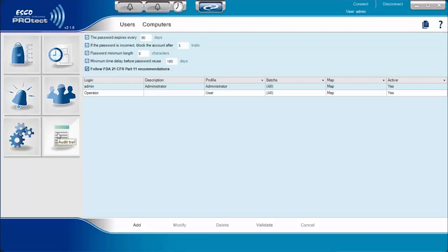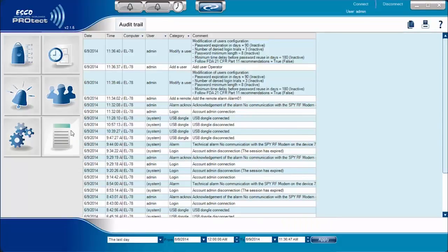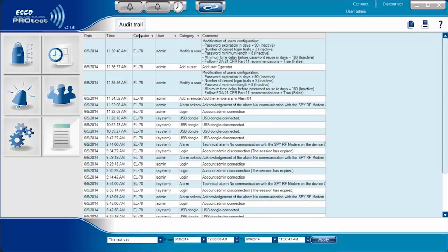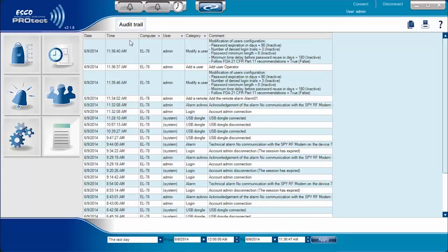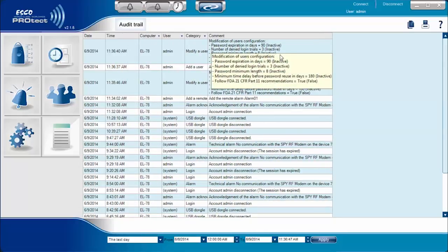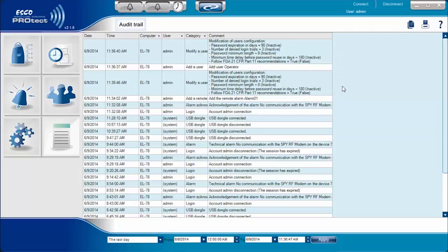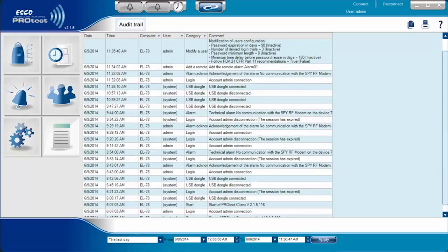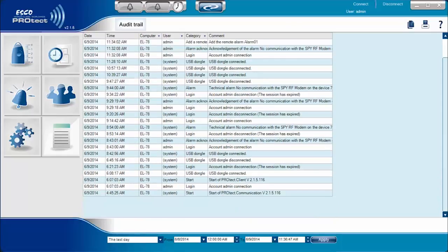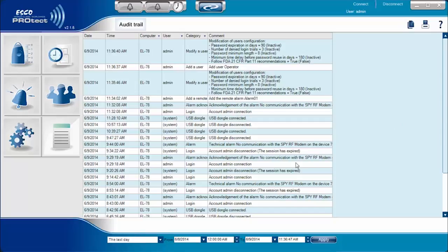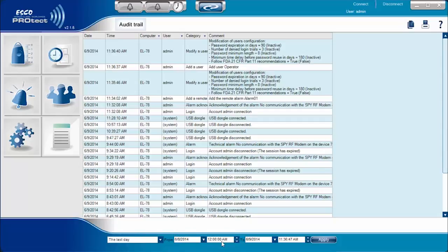The Audit Trail of ProTech is the informer of ProTech. It records all actions performed in ProTech, such as modification of configuration, log in, log out, and start of a client PC. This can also be sorted depending on several criteria such as sort by date, by user, by PC, or by event category.